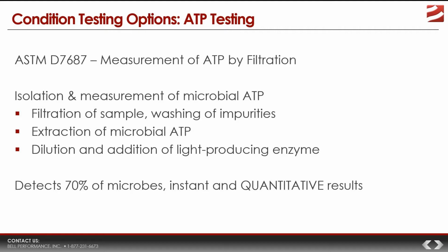Now, the basic process, I've done this test 100 times. I'm better at it than I was at the beginning. It's really not the most complicated thing that you would ever have to do, but it is something that takes a few times to master, which is to say that any technician could master it if they put their mind to it. Here's the basic process.